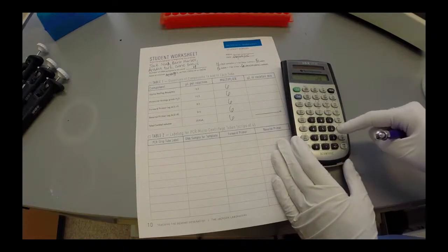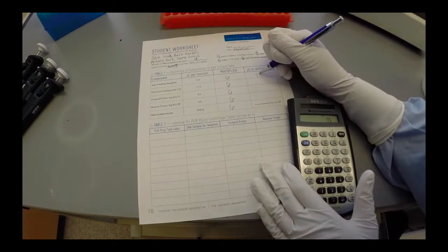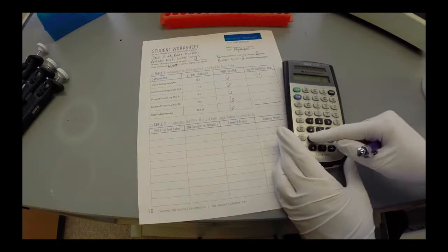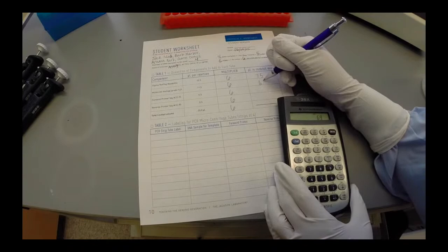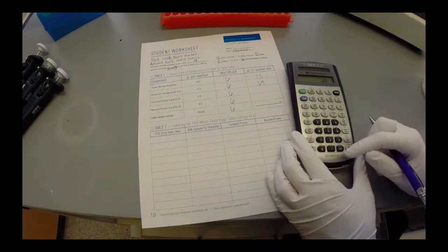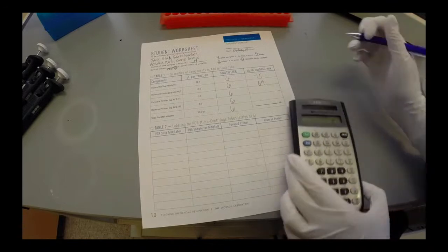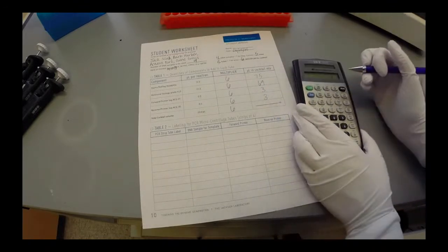12.5 times 6 equals 75 microliters of red taq added to the cocktail. 11.5 times 6 equals 69 microliters of water added to the cocktail. 0.5 times 6 equals 3 microliters of each of the forward and reverse primer added to the cocktail.